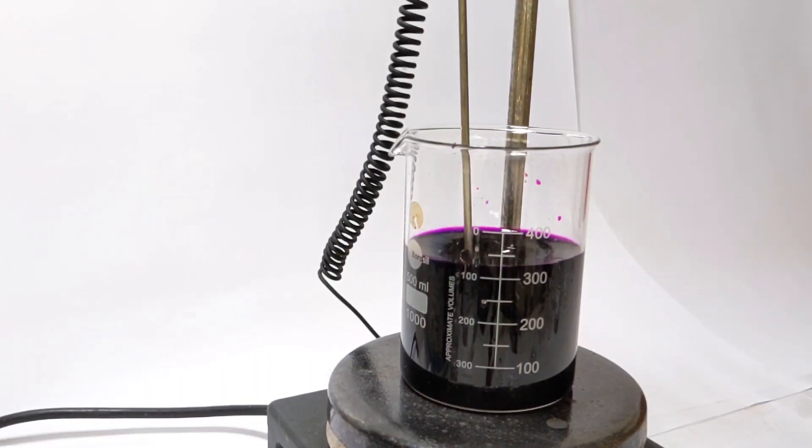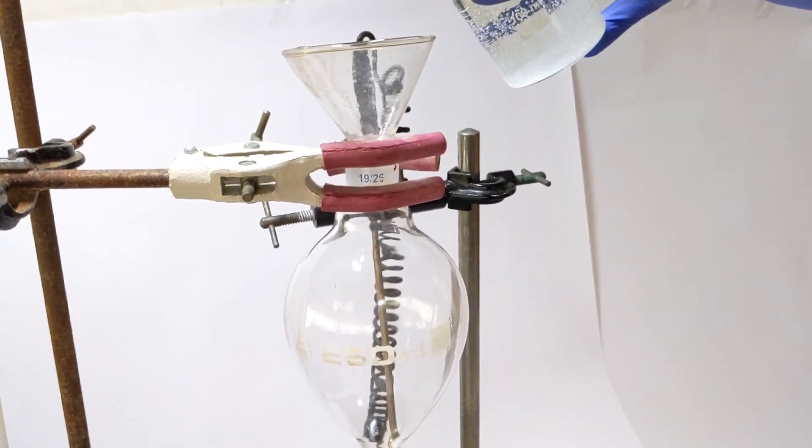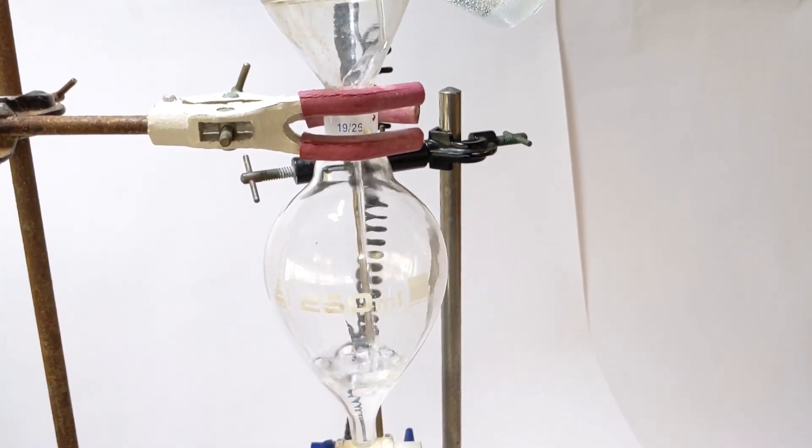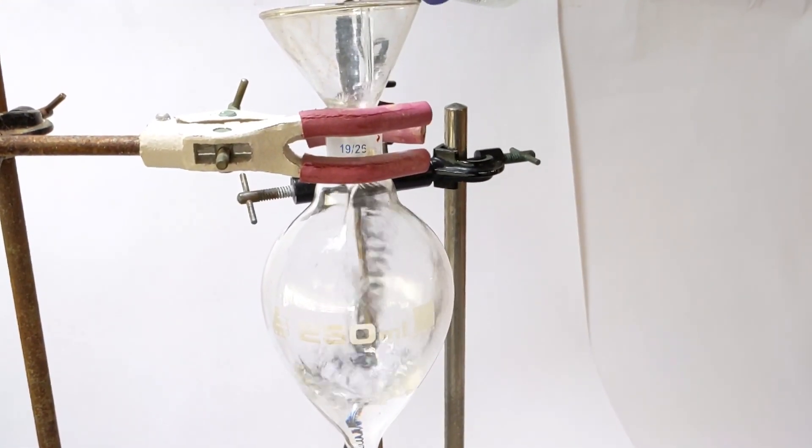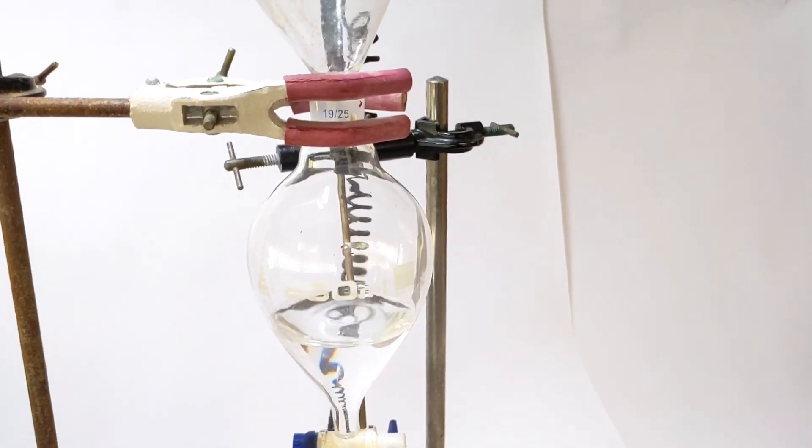Some 3% hydrogen peroxide solution was taken in a separatory funnel. I took about 50 milliliters. The separatory funnel was then clamped and fixed just on top of the beaker and hydrogen peroxide was allowed to fall dropwise to the solution.